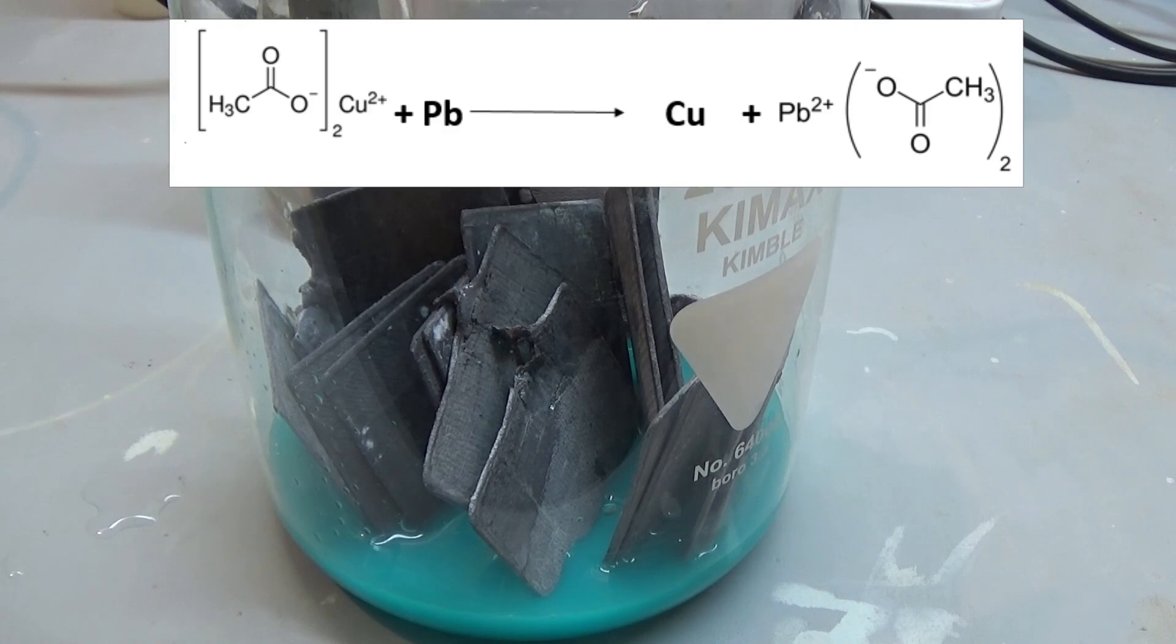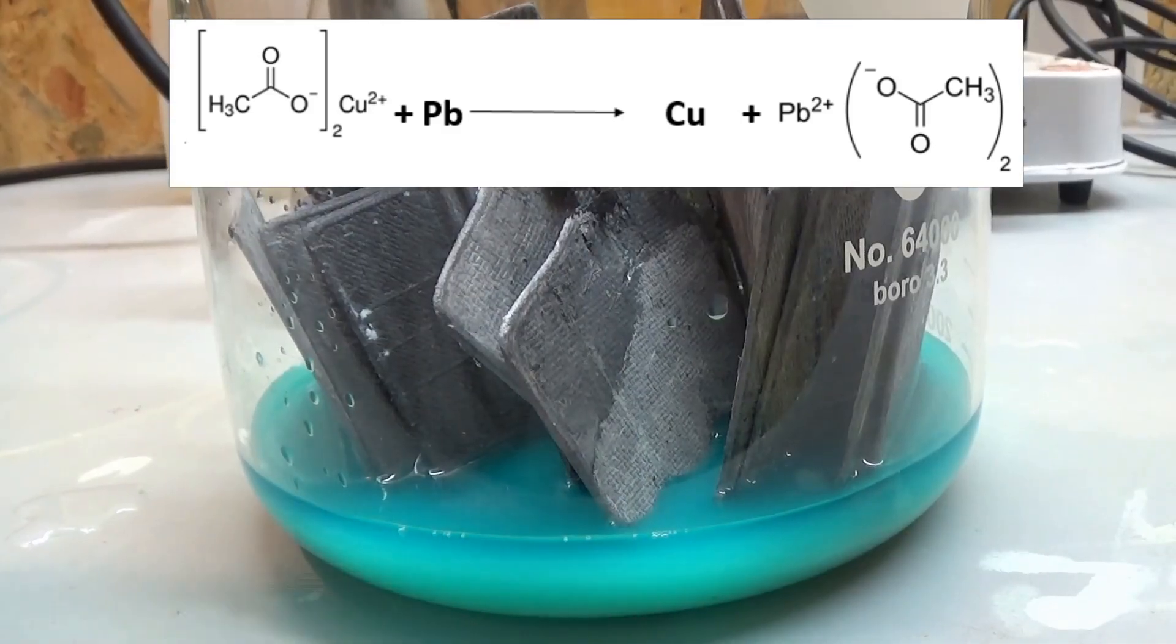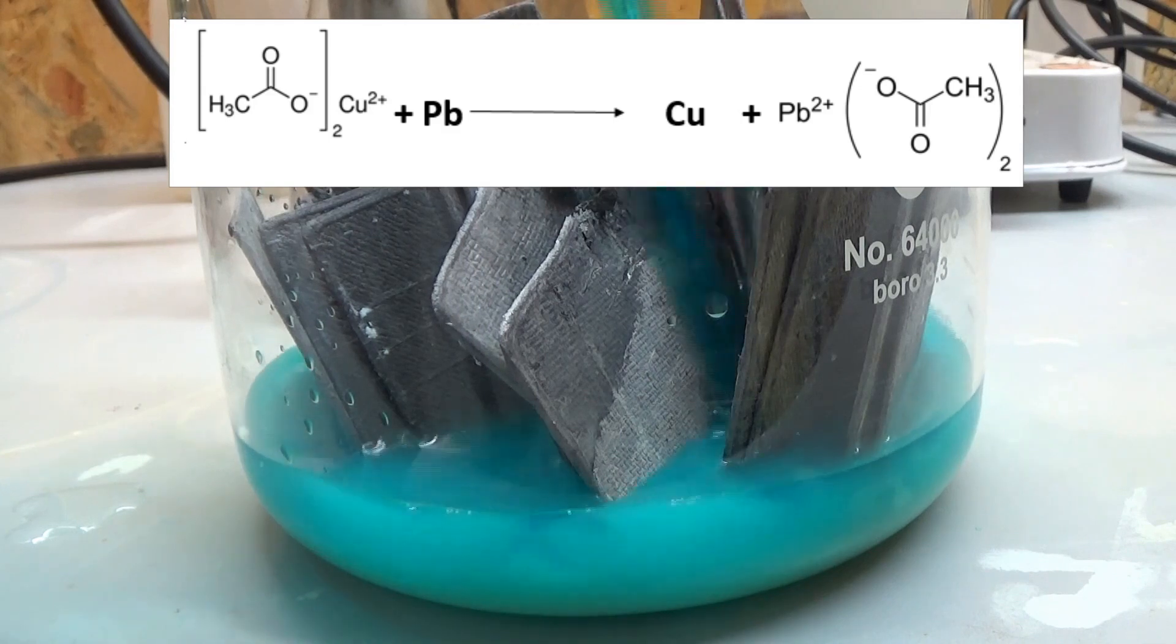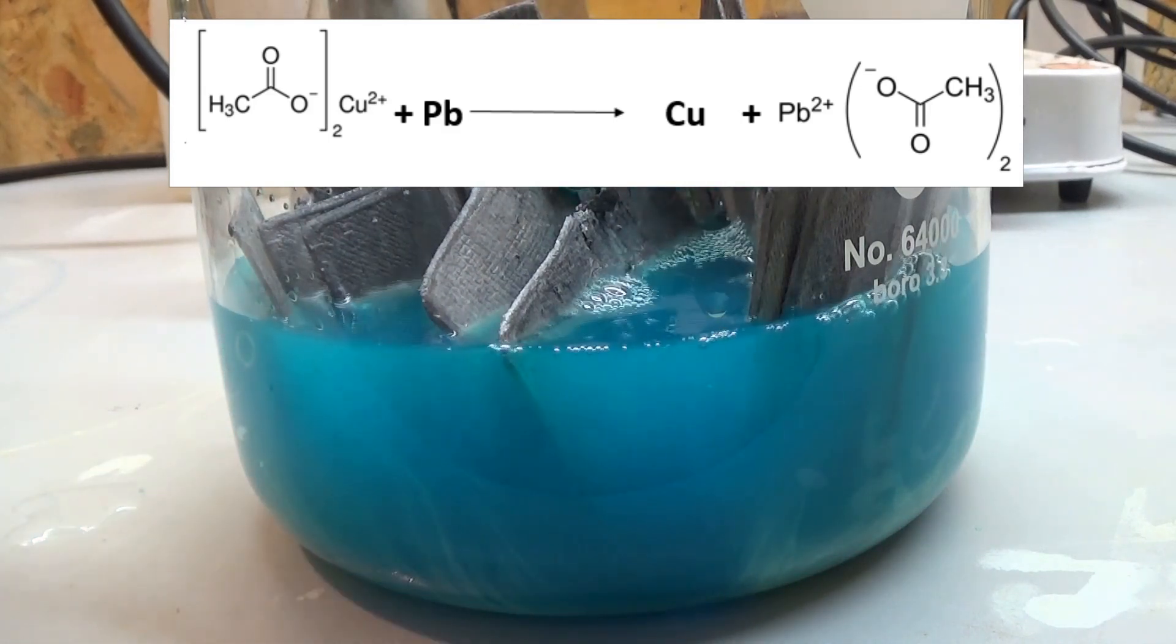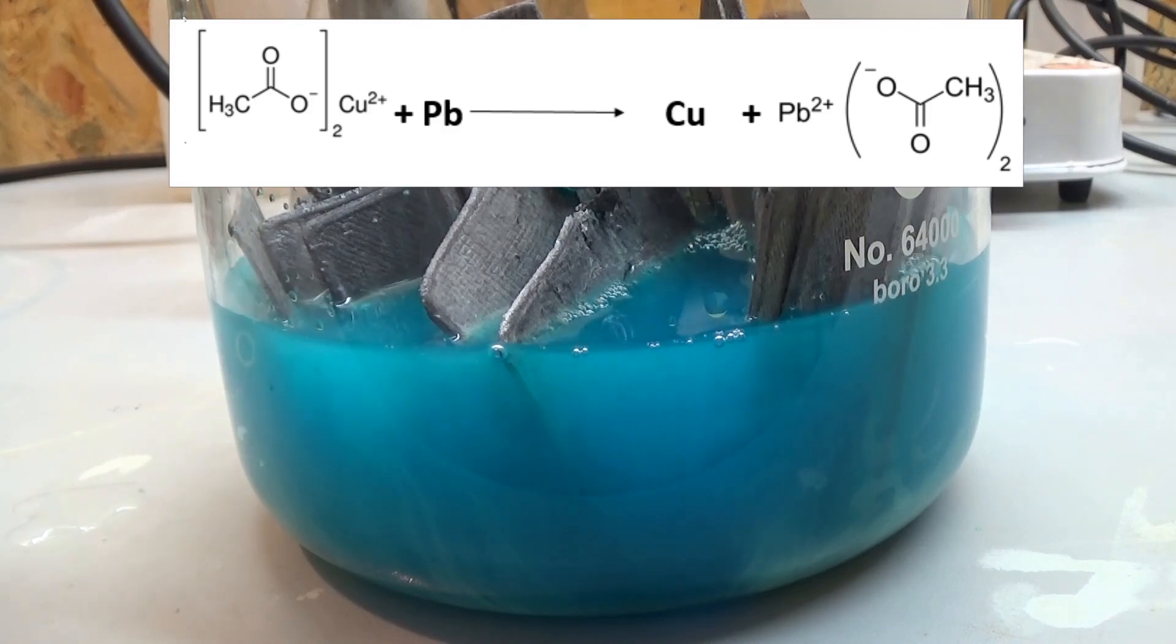What's happening is a redox type replacement reaction where the copper 2 plus ions are reduced to elemental copper which crashes out. The elemental lead gets oxidized to lead 2 ions and forms lead acetate with the acetate anions from the copper acetate.